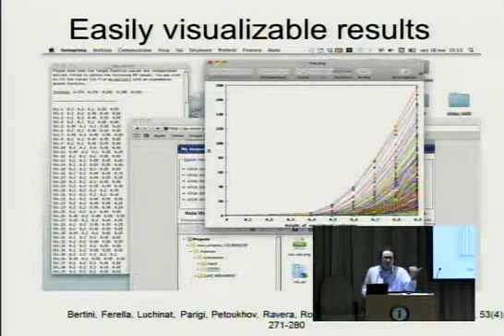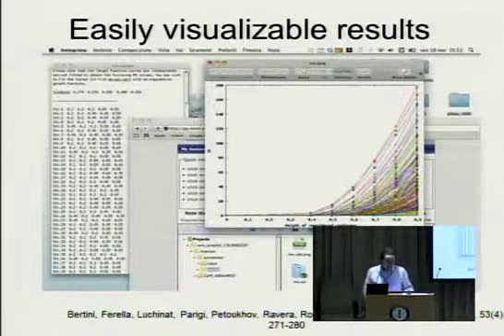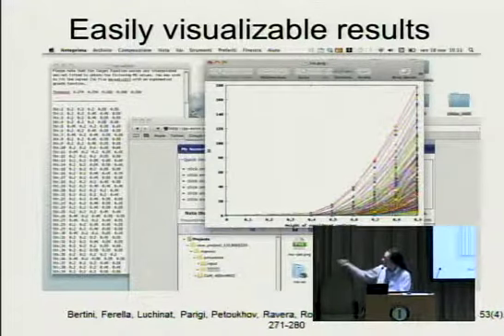And there was an option in the web portal that allowed you to do that. So you can tell the program which limit you should reach on this side, the non-interesting side, and tell the program not to compute that in subsequent rounds, so that you spend less time computing useless ensembles.